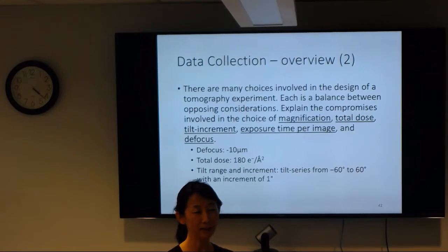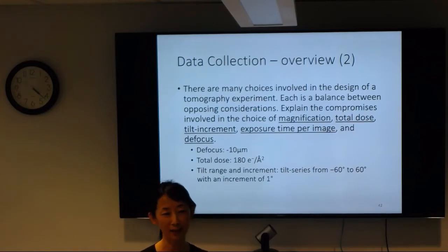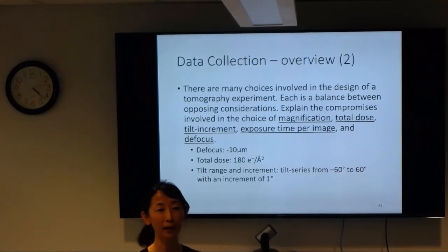In this case, they didn't say what mag or pixel size they used, but we know the target they want to look at is about 10 to 20 nanometers. I would pick maybe 5 point something angstrom pixel, or slightly lower, 3.5-ish. I wouldn't go higher than that. I think that is very good for the target already.